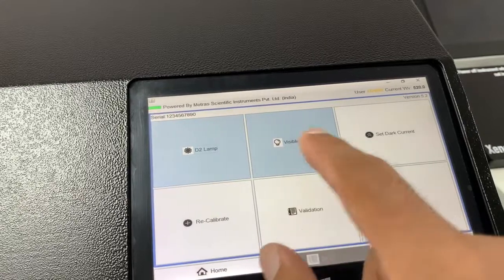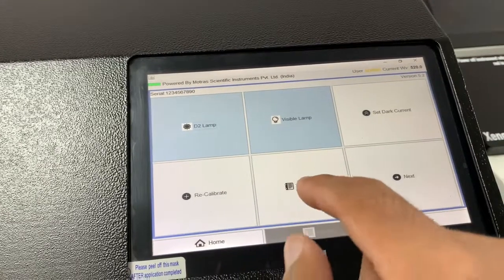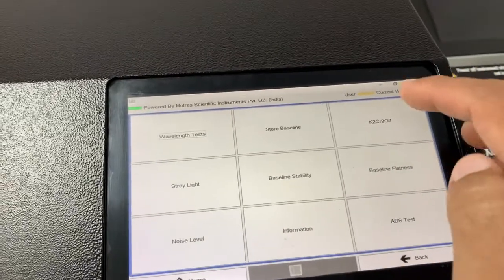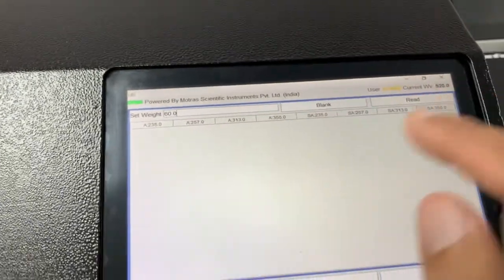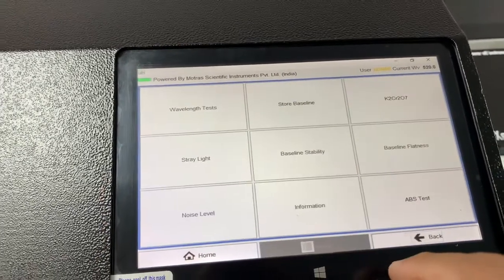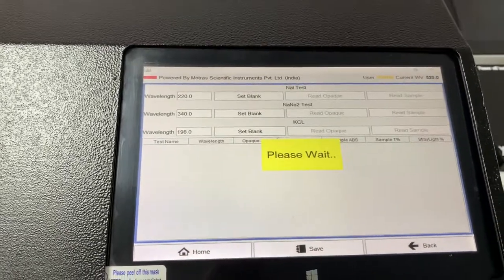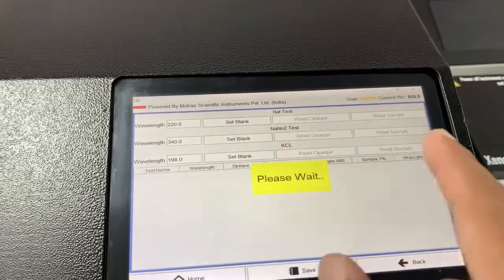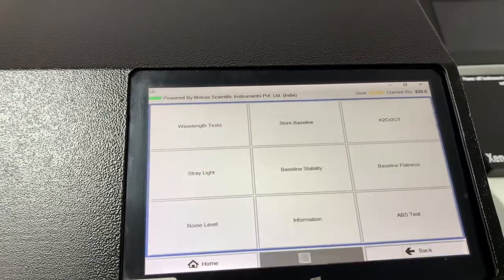Then we have settings. In settings, we have options to switch the lamps on or off. The main option is validation — all the pharmacopoeia validations are built in. For example, the potassium dichromate test: you can punch in the weight in milligrams and the system will automatically compute the absorption and specific absorption for that weight. We similarly have a wavelength test, noise test, and stray light test with NaI, NaNO2, and KCl. The system automatically computes the dark current, and these reports can be saved as PDF for easy assessment.